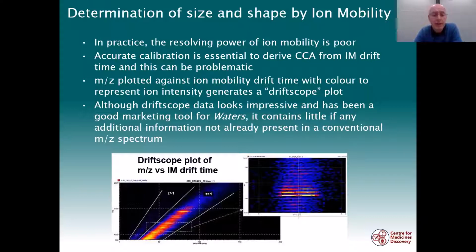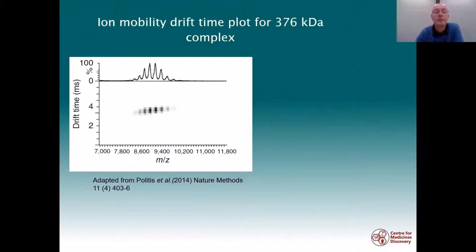What I would say is the first ion mobility QTOF was launched by Waters about 20 years ago, and they used this very successfully as a marketing tool because it does look like you're getting new information. However, there isn't really anything new there, and I just want to explain that.